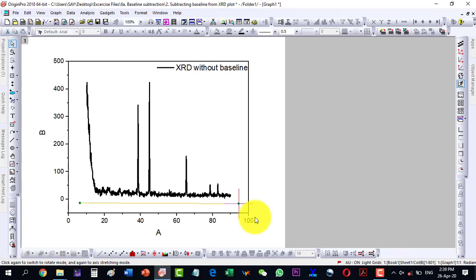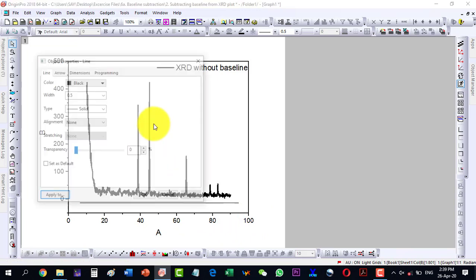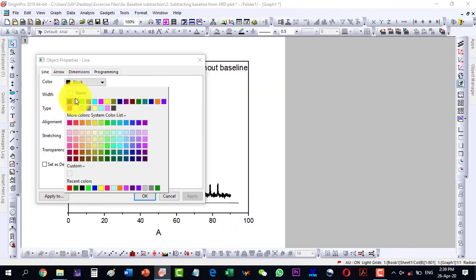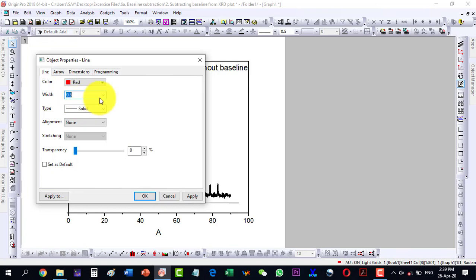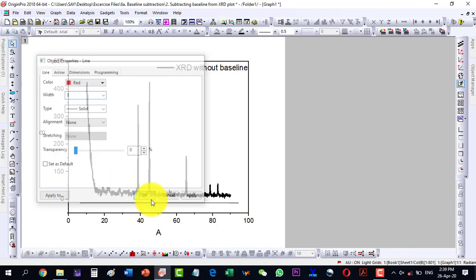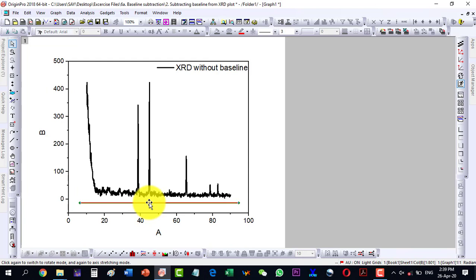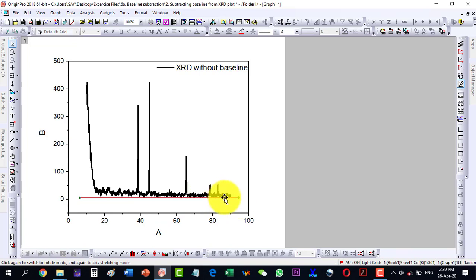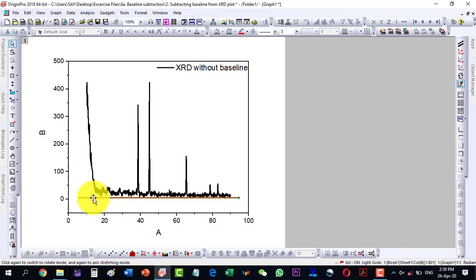Let me remove any bend from the line so it becomes straight, then change the width and color to make it more visible. Now we can see that the data needs a little bit of baseline correction — it is almost straight here, but after this point it is rising a little bit from the straight line.